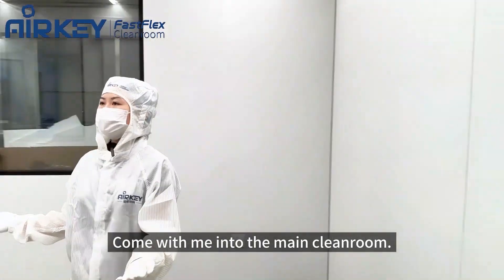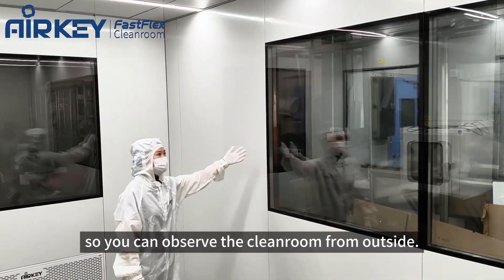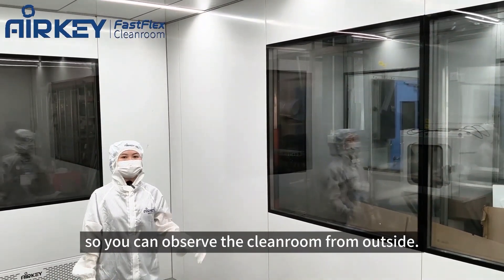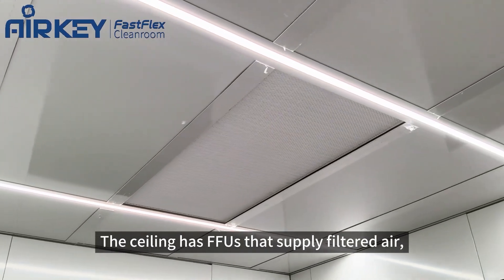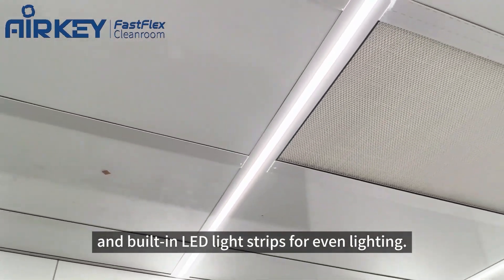Come with me into the main clean room. There's a tempered glass window on the wall so you can observe the clean room from outside. The ceiling has FFUs that supply filtered air and built-in LED light strips for even lighting.